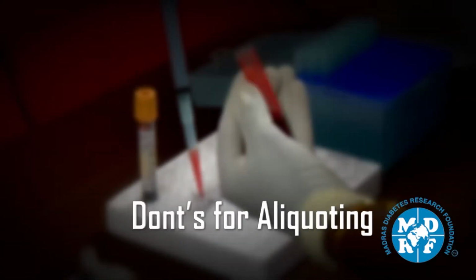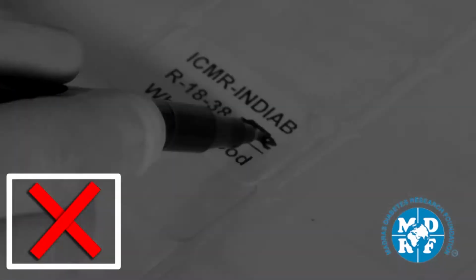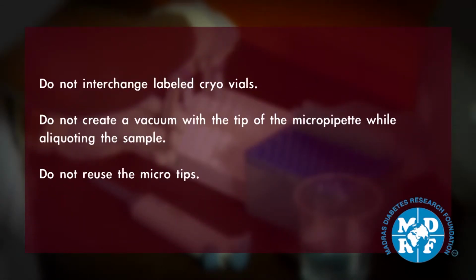Don'ts for aliquoting. Do not overwrite on the labels. Do not send the sample without sealing the labels with sellotape. Do not interchange labeled cryo vials. Do not create a vacuum with the tip of the micropipette while aliquoting the sample. Do not reuse the microtips.